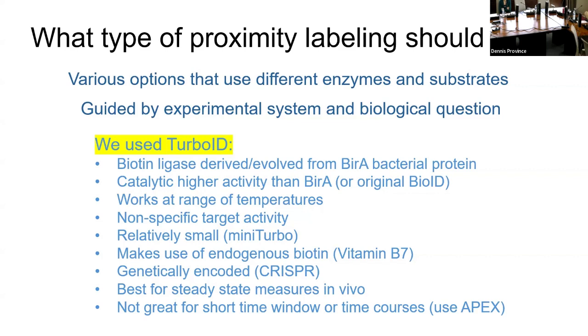It's genetically encoded, so physiological levels. It's really going to be best for steady state. Okay, so what we did is we took worms, a mixed stage population, and there are advantages and disadvantages of doing something like that.